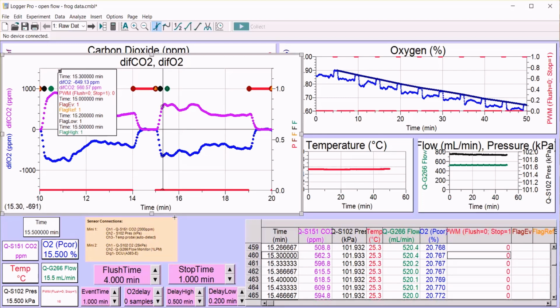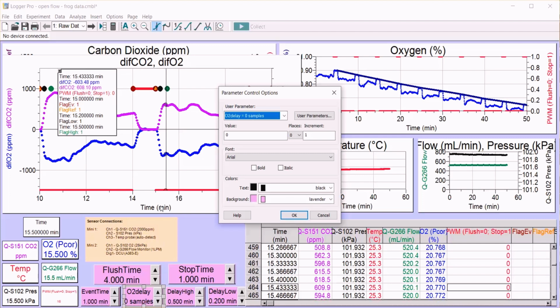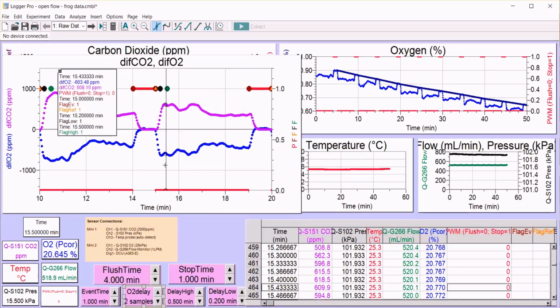Maybe again we're looking at one or two sample data points. So I'll just adjust this by 2 and see whether that brings them. No, actually that made things worse. We may have to go reduce to a negative number, maybe -1.